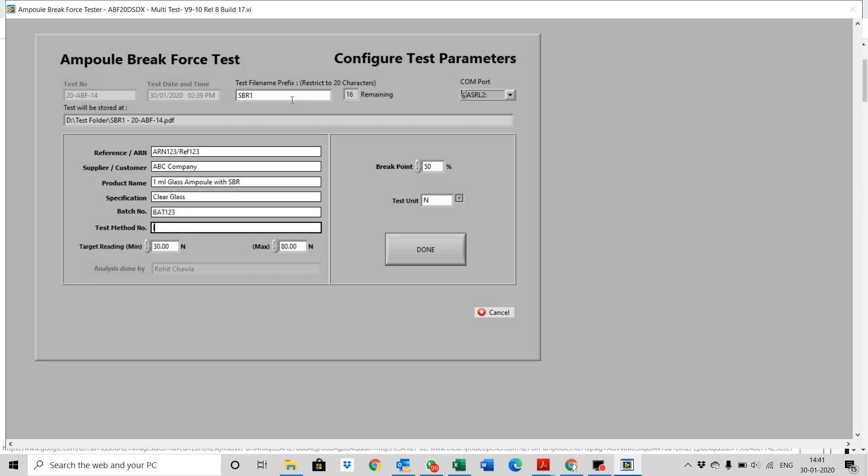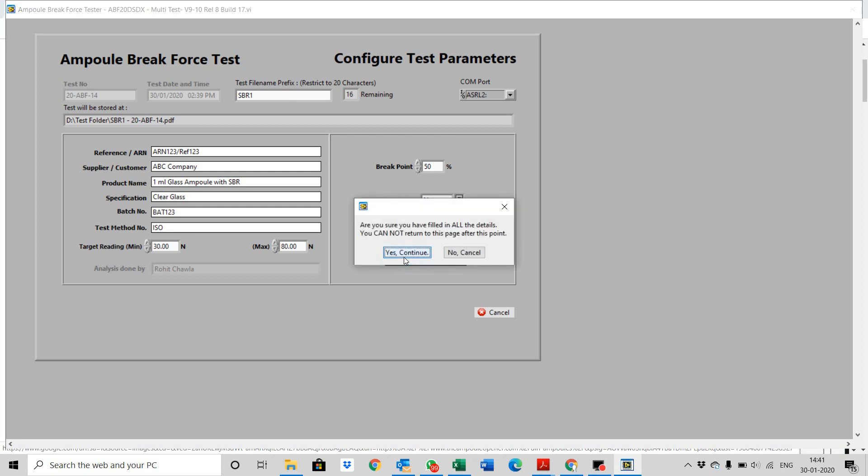Set the target minimum and maximum braking force. Click on done, and then yes.